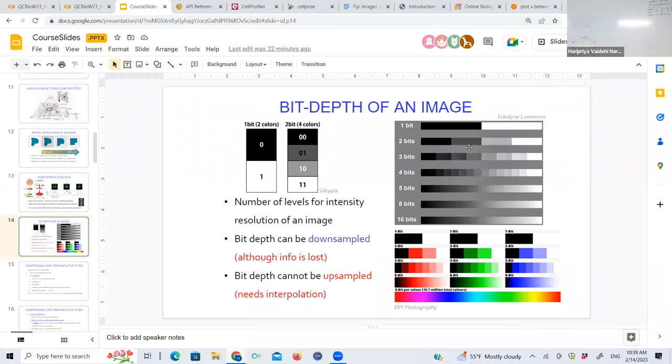So when you start off, please collect the best signal you can. There's nothing you can do about it afterwards. And it's like they tell you about makeup, right? There's no amount of foundation you can put if you don't have healthy skin or whatever. It's the same. There's no amount of makeup you can put on an image if you haven't taken a healthy, good image to begin with. Sorry if that was a weird analogy.